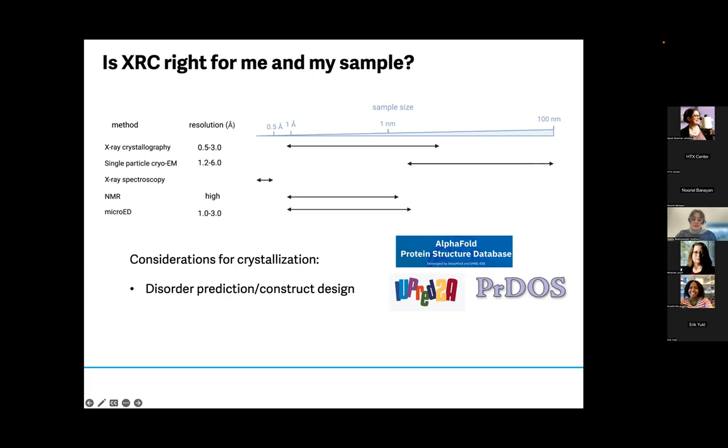We've also had people today talk about different crystallization chaperones. So for example, affinity tags like MBP or MVP, excuse me, can be used as crystallization chaperones. It can be hard to predict sometimes, but one of the main things that I like to do when I begin a structural project is to really work on trimming those disordered regions away and making sure that these regions don't impact the protein activity that you're interested in studying. And this can really help you hit the ground running with producing diffraction quality crystals.